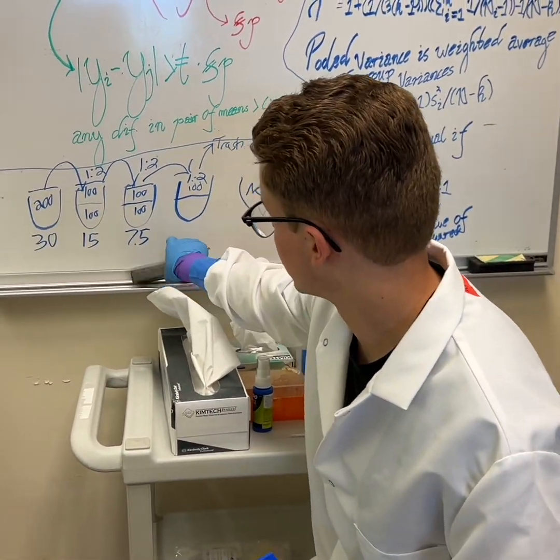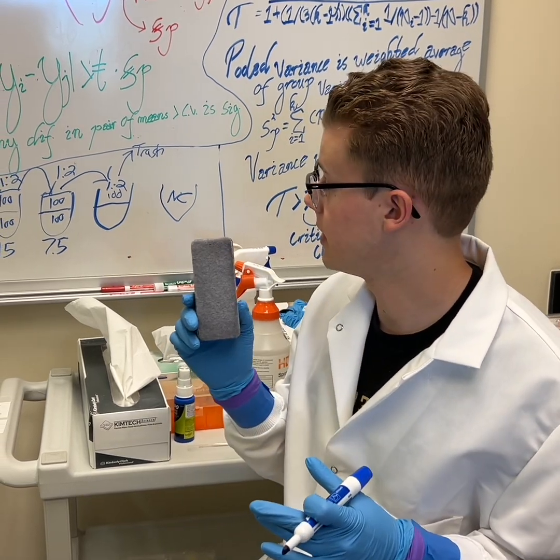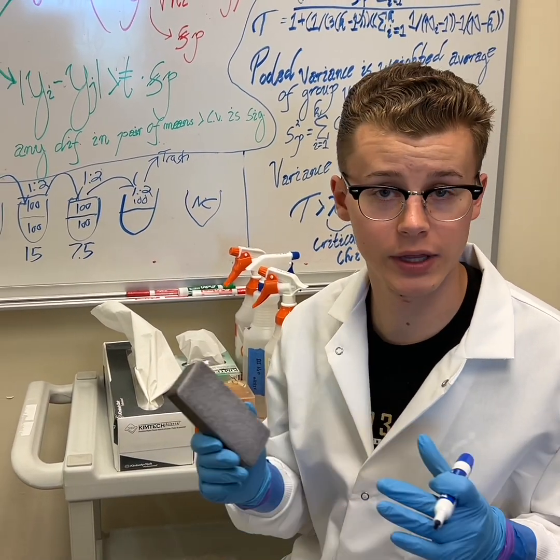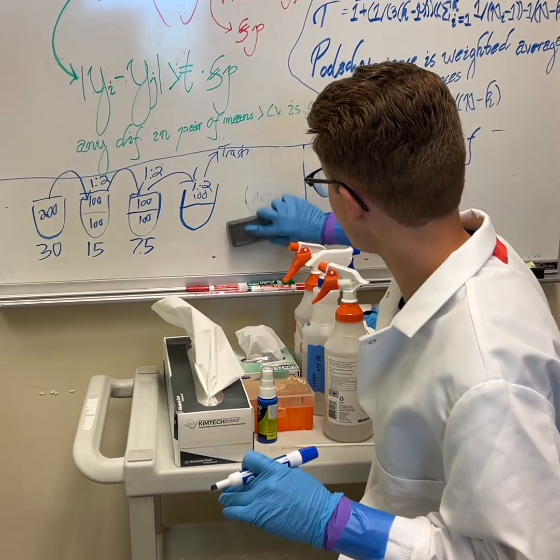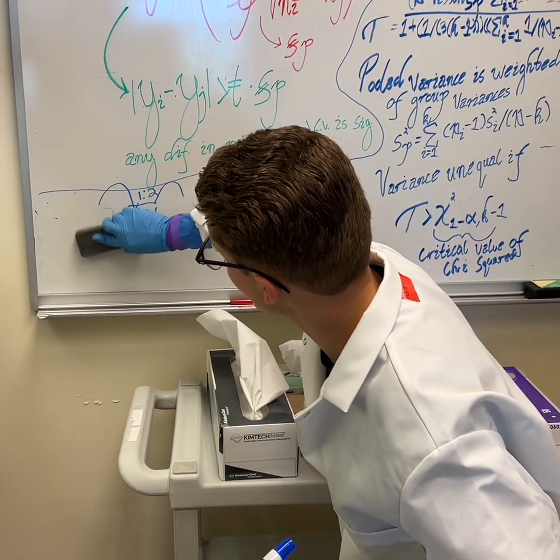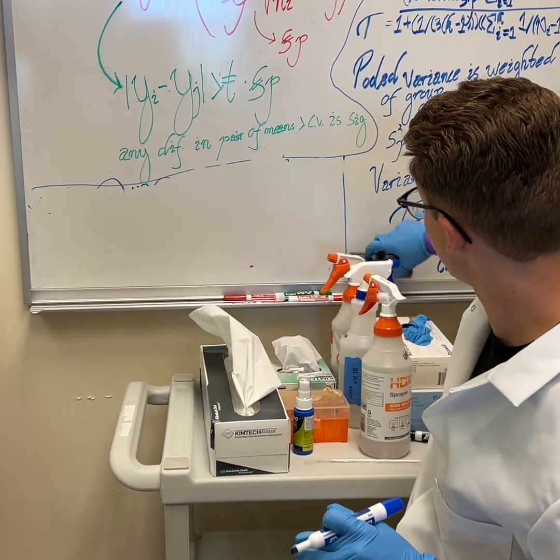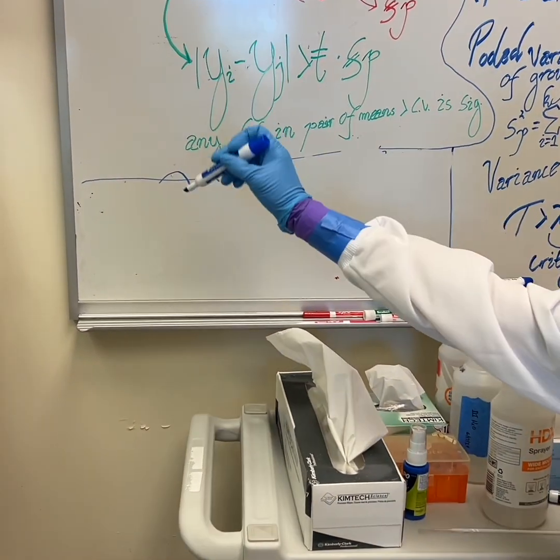One more thing that I want to draw on the board before we actually get the plates out and show you is going to be tip placement within the plates. And so what you'll see is that for every single well, except for your negative control, there's going to be a biofilm at the bottom of the well.